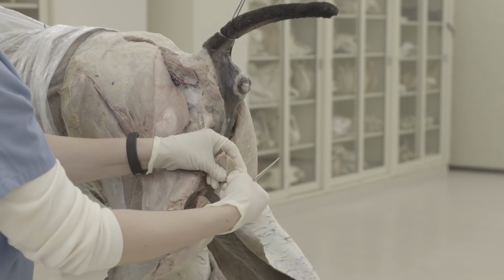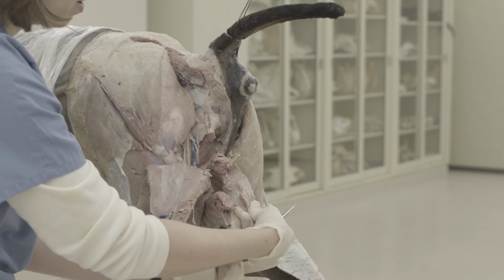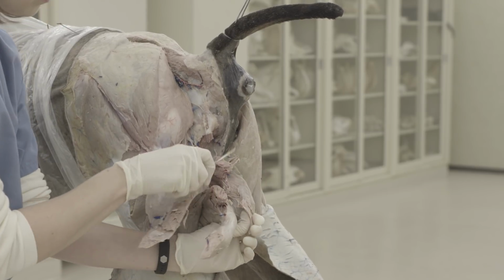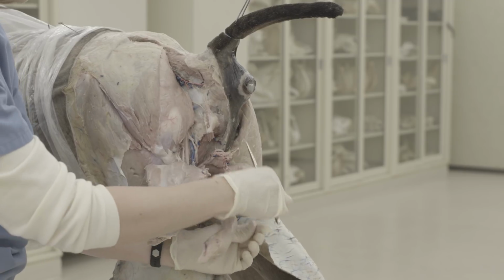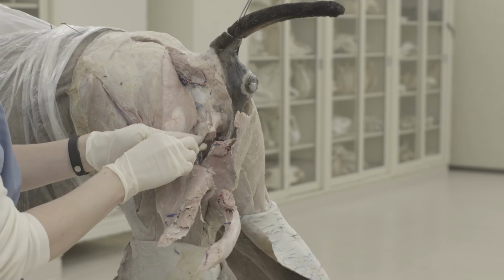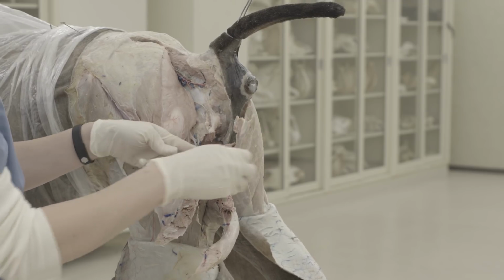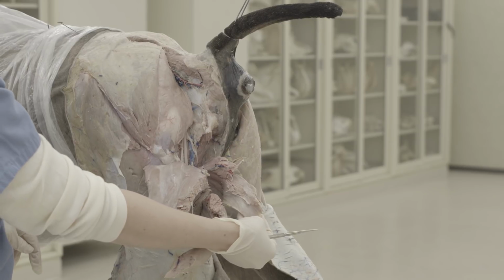And in the pony it will have these two thick parts to it. So if you pull it down, you'll see this nice thick belly here. So there are two bellies to this muscle, and you're going to cut the first one and pull it away, and then you'll have to cut this away also before you can actually pull it further distally. So make sure you're cutting both parts of that muscle to reflect it.